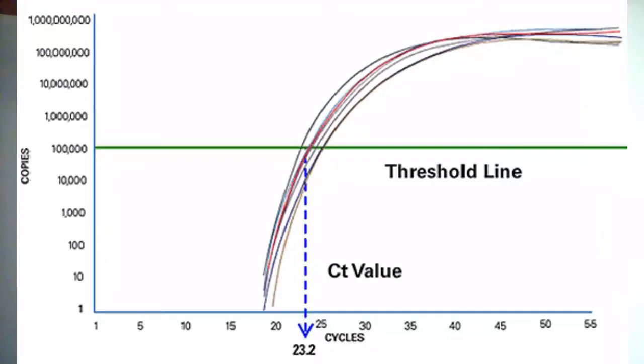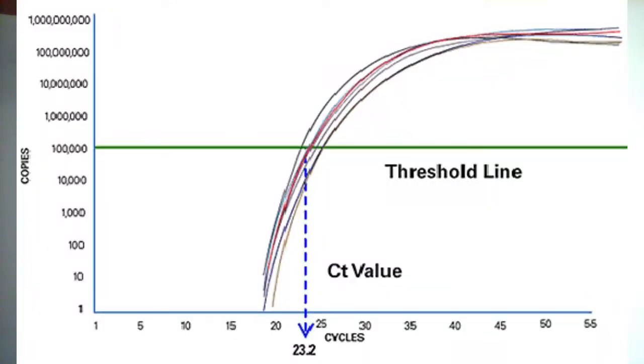The term CT value, cycle threshold value, came from the cycle of the machine, because to reach the threshold level of fluorescence or threshold level of target to determine, the machine needs to run a certain number of cycles. If there is enough target, then the machine will require a small number of cycles to detect the target that reaches the threshold level.